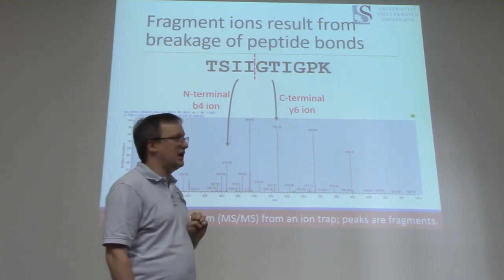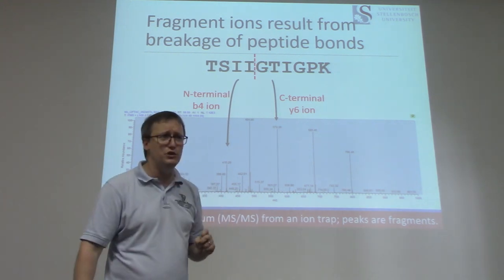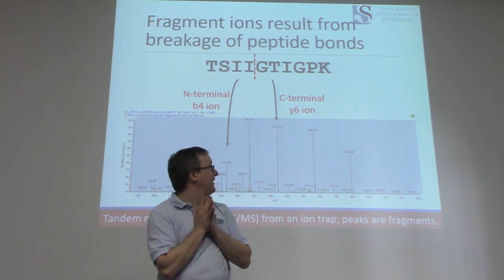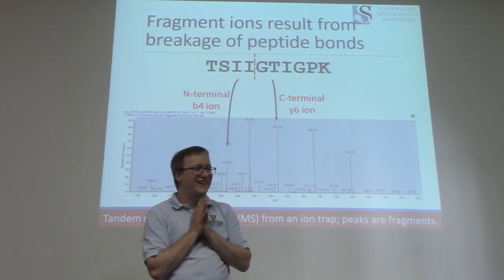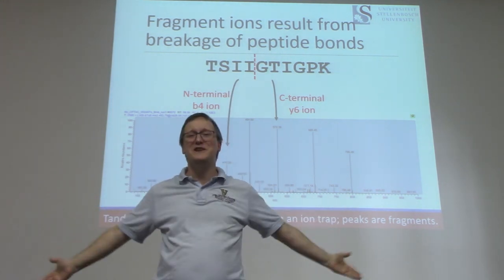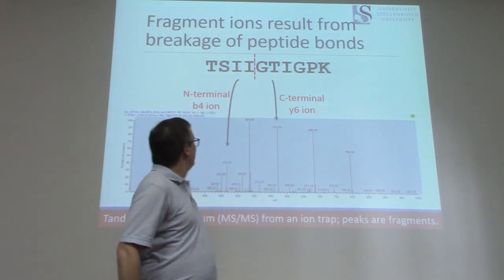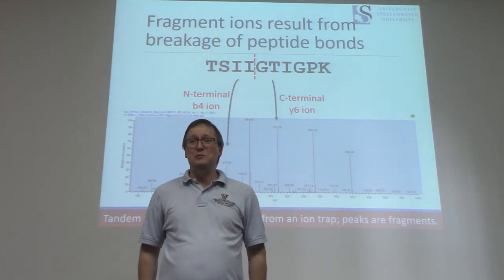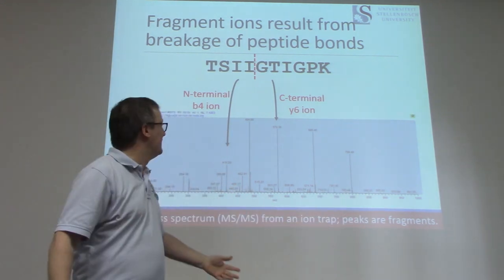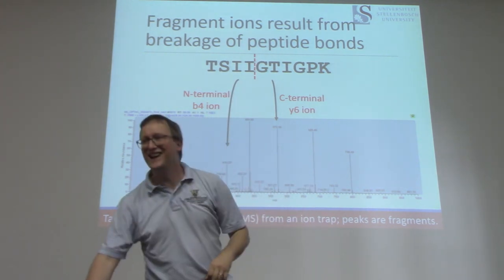Where would an ion with a mass 113 higher be? 572 plus 113. Who's got my answer? She's got it. Tell me. Speak your truth. 572 plus 113 is? 685. When we look in the spectrum, what do we see? Check it. Right there it is.